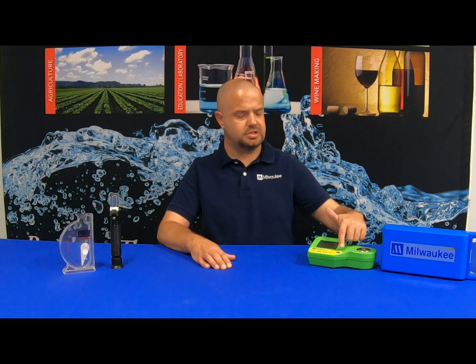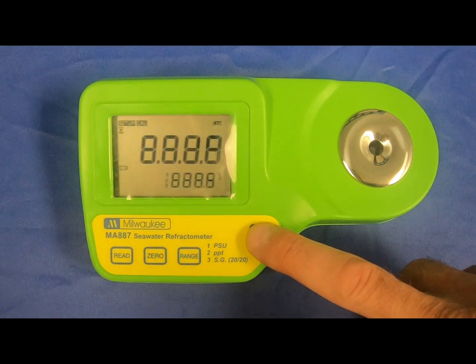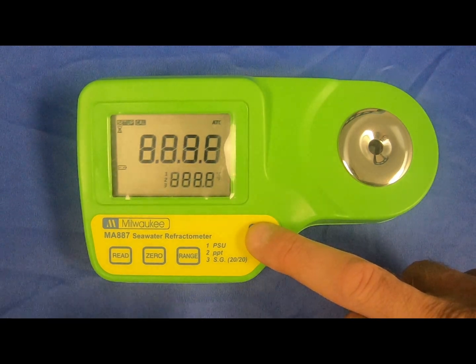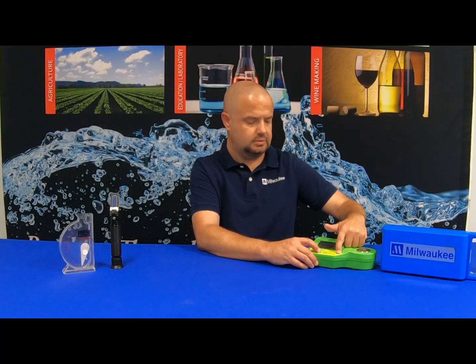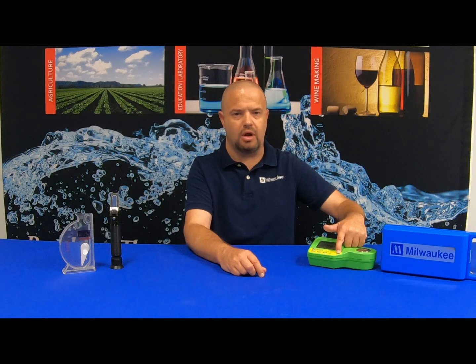You can change the temperature from Celsius to Fahrenheit. To do that, you must hold the on/off button when the unit is off. You'll see some displays pop up and then the Celsius icon will appear. While still holding the on/off button, hit the zero button to change it from Fahrenheit to Celsius, or hit it again to change back. When you've set your desired selection, simply remove your finger from the on/off button.